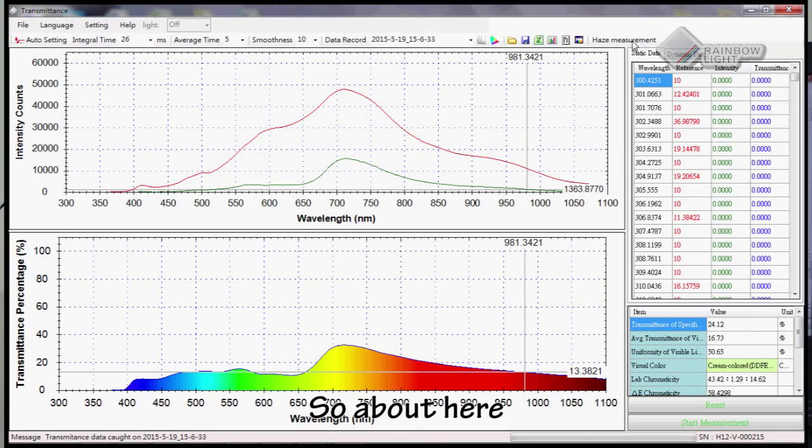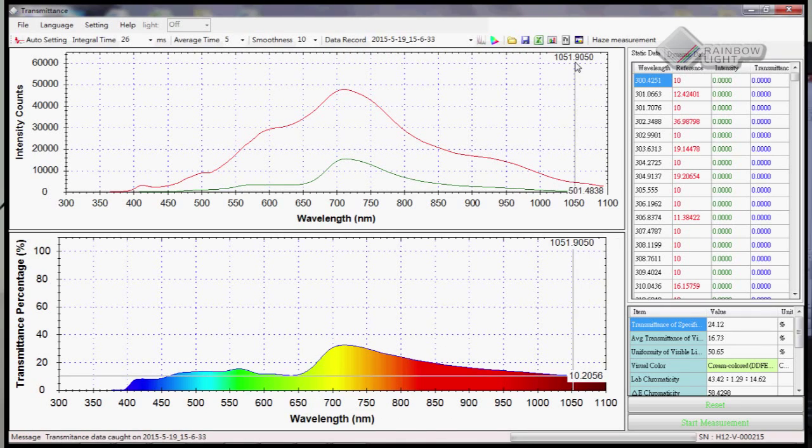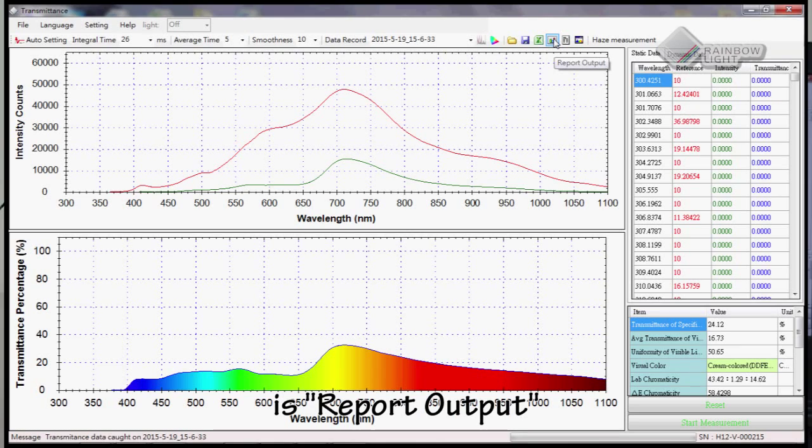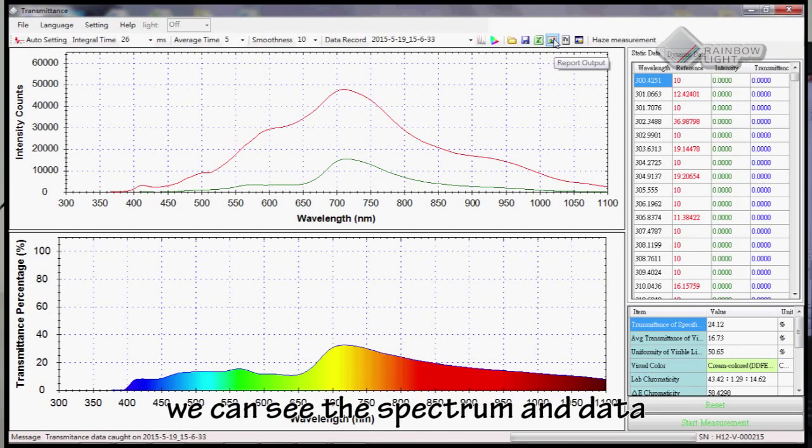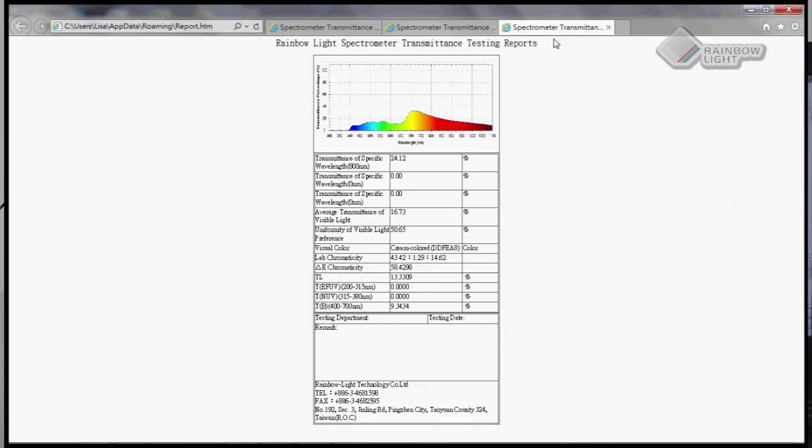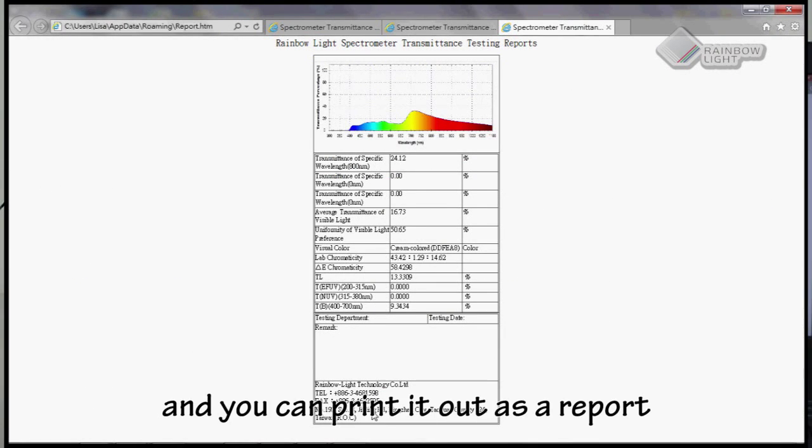Here, this is the report output. Click here, and we can see the spectrum and the data. It will look like this. You can print it out as a report.